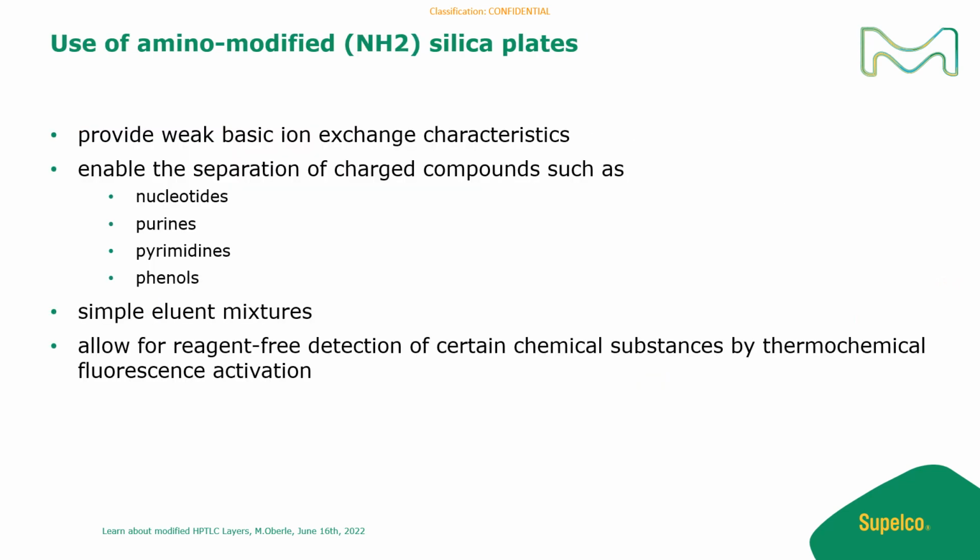On this slide, some facts about the amino-modified layer are summarized. The amino-modified layer provides a weak basic ion exchange characteristic, which helps in some separations. This unique feature enables the separation of charged compounds such as nucleotides, purines, pyrimidines, or phenols. So you can also use a simple eluent mixture for the separation.